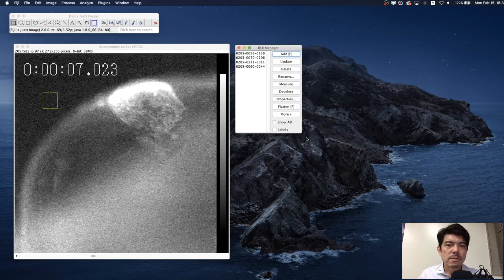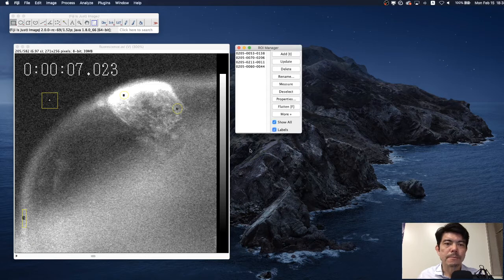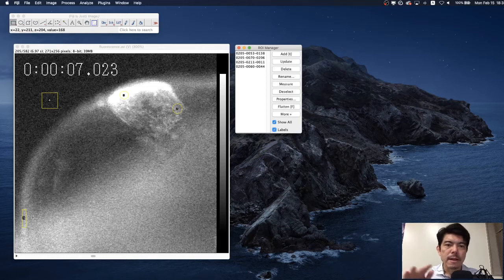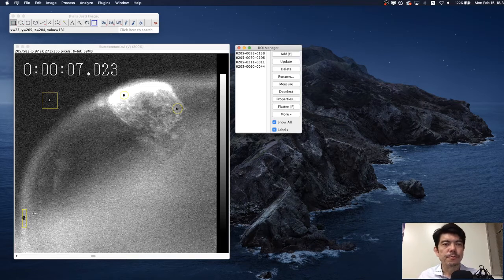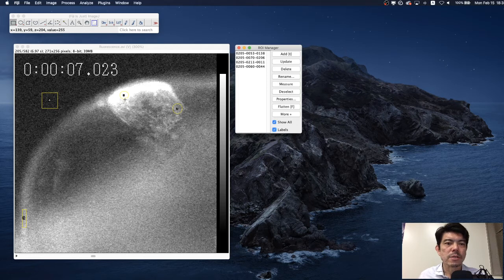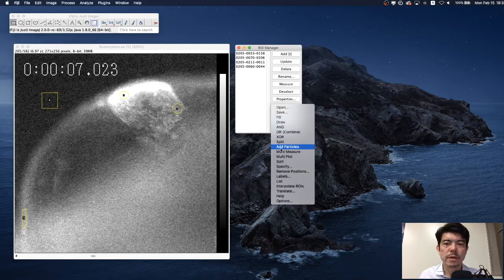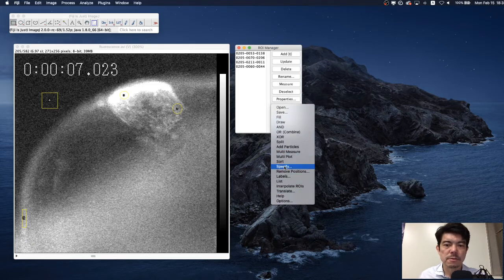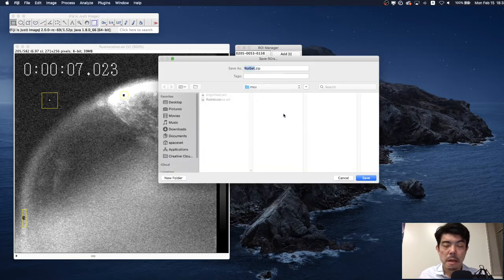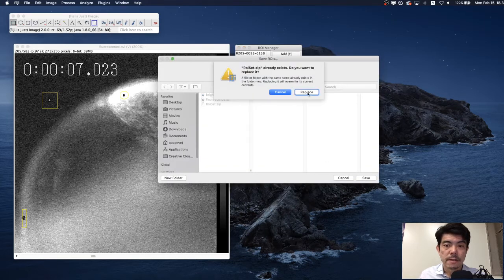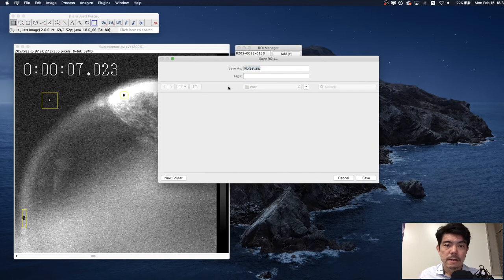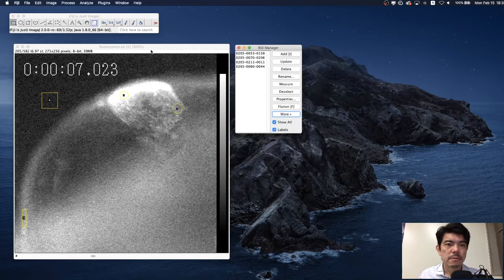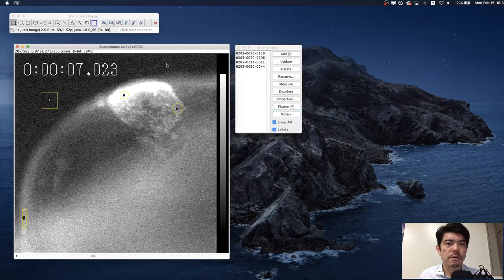What's important is that we keep record about these ROIs because often later we need to remember which region of interest we use. For that purpose, we save this region of interest from here. Save ROI. Now we are ready to go.